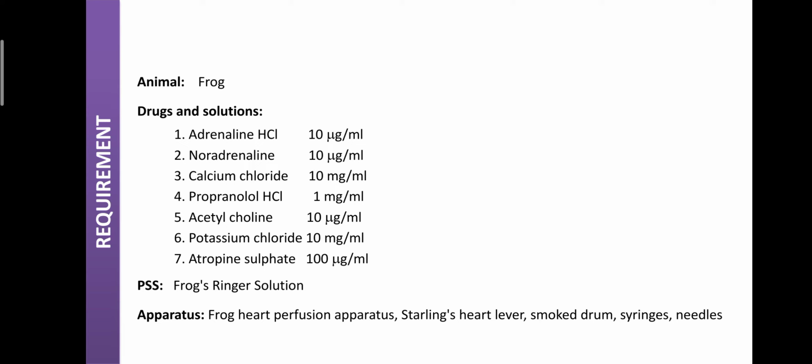It consists of sodium chloride, calcium chloride, potassium chloride, sodium bicarbonate and glucose. And regarding apparatus, required are a frog heart perfusion apparatus, Starling heart lever, smoked drum, syringe and needles.